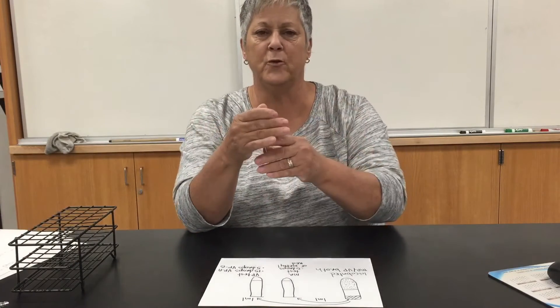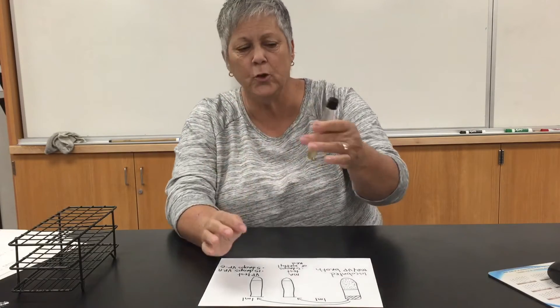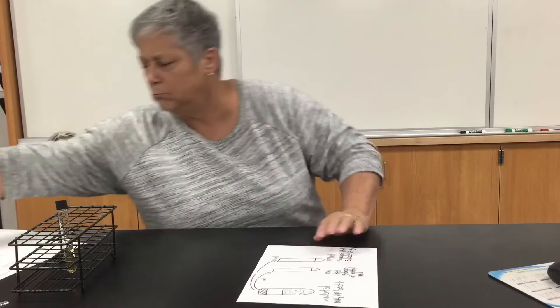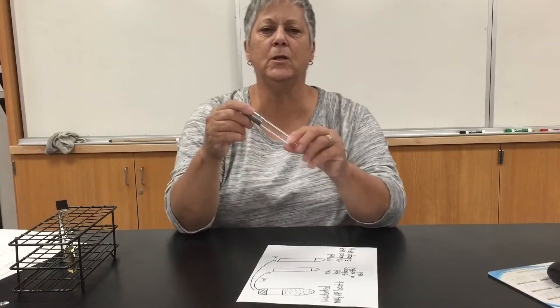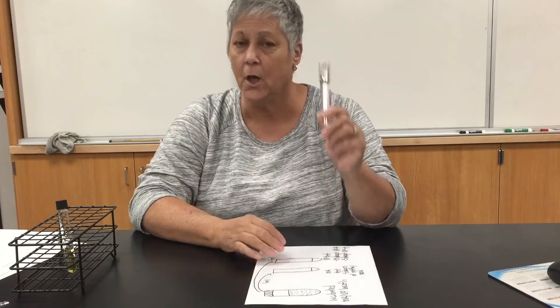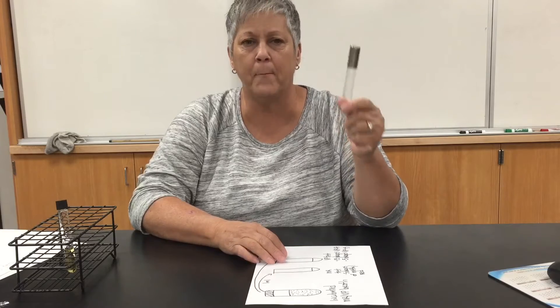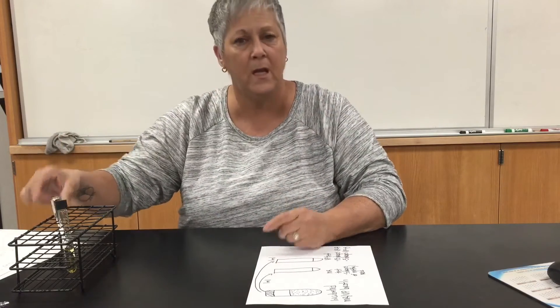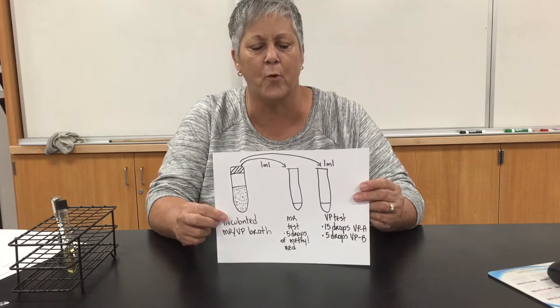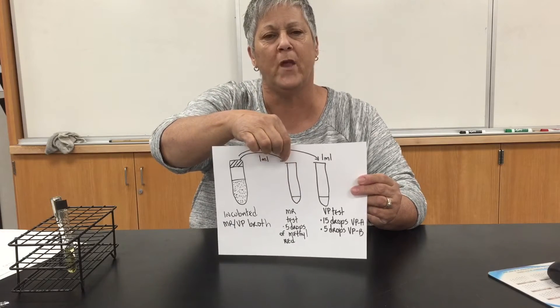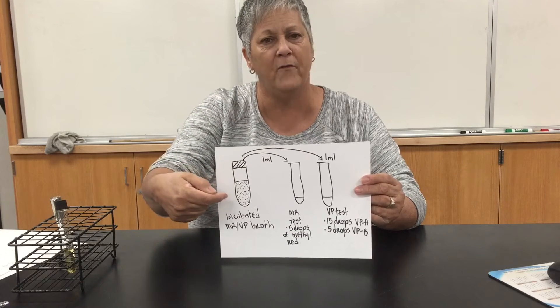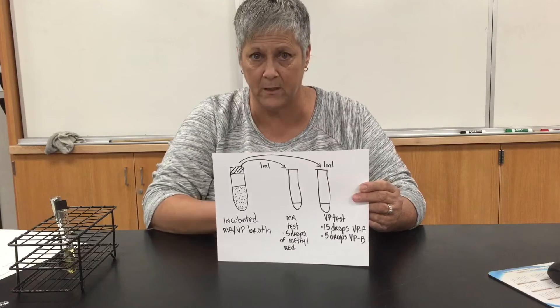After incubation, the broth should be nice and turbid. Agitate the tube to stir up the contents. You will need two clean test tubes with a Morton cap per microorganism tested. You'll do the MR test in one of these tubes and the VP test in the other. Use a sterile pipette to transfer one mil of the incubated broth into each of the two tubes.